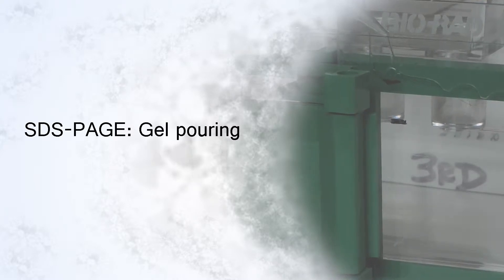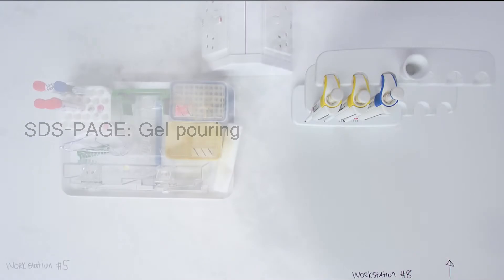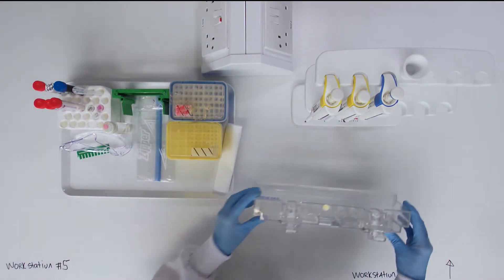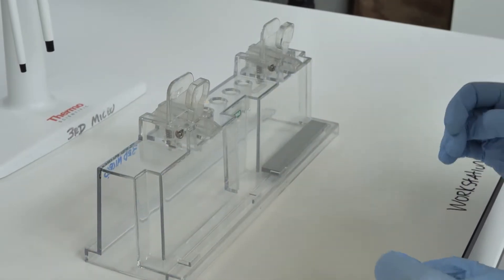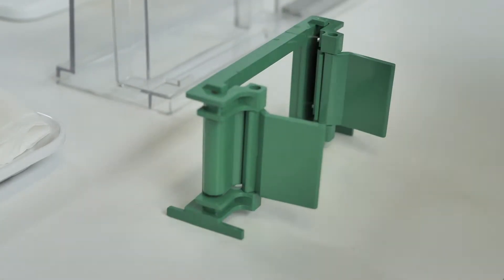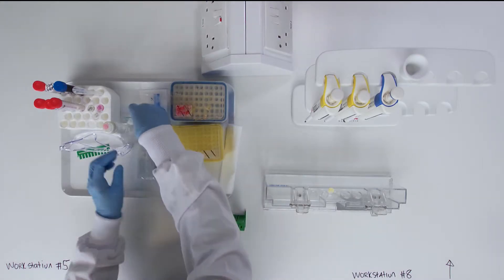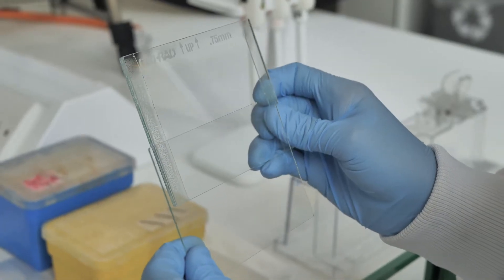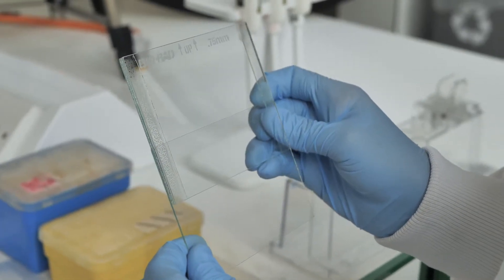SDS Page Apparatus Assembly and Gel Pouring. Begin by preparing the gel sandwich.